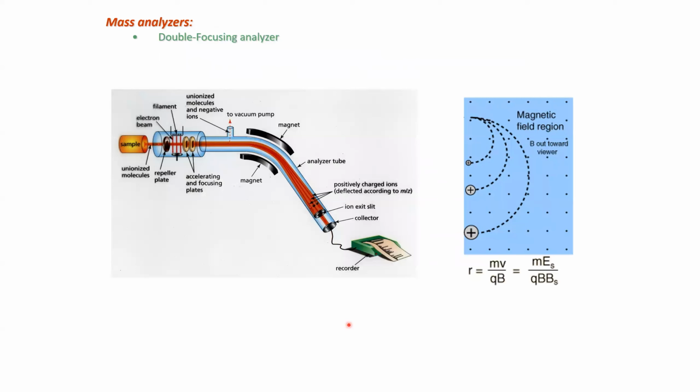So double focusing analyzers, that's a different kind. So this is just a schematic of that. So it's just a different schematic. Still got the same components as before.